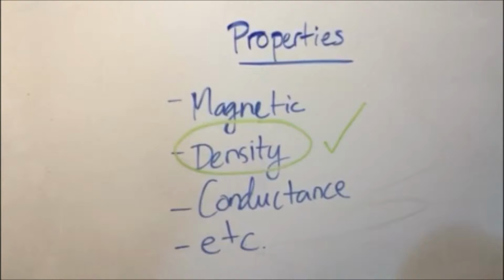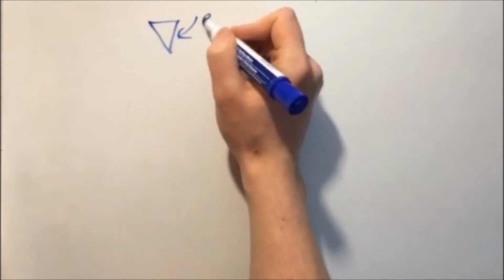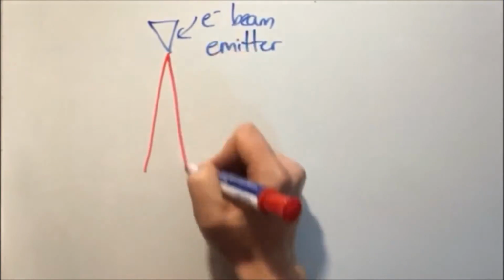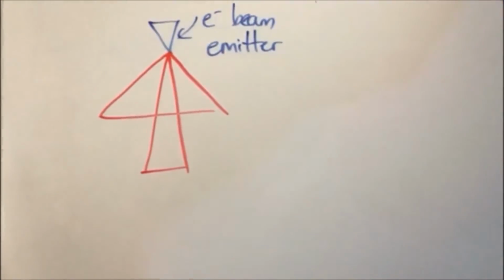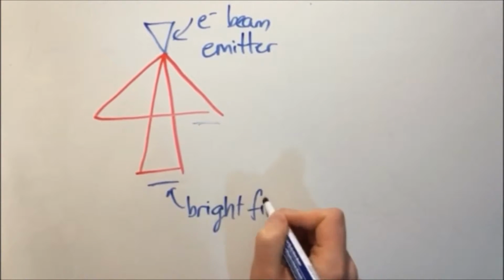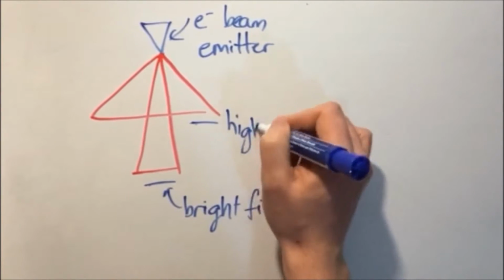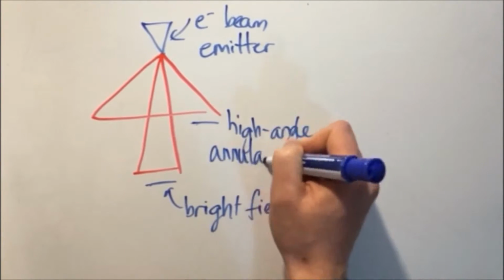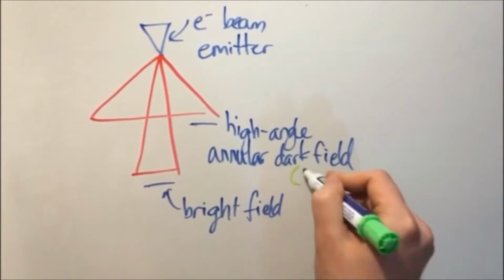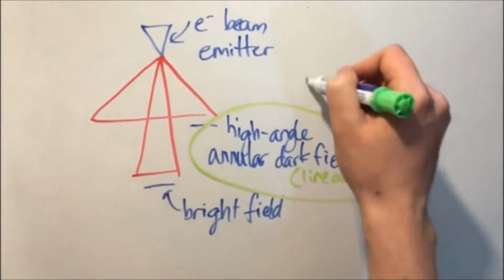There are a couple ways to record images like this, but the most popular choice is annular dark field STEM. This technique is useful because there is little phase and diffraction contrast, and its transfer function acts as a low-pass filter, meaning that image edges are not exaggerated, which is great for 3D image reconstruction. Most importantly, the image recorded depends almost exclusively on the projected density of the object.